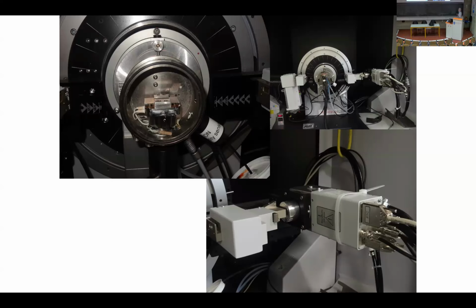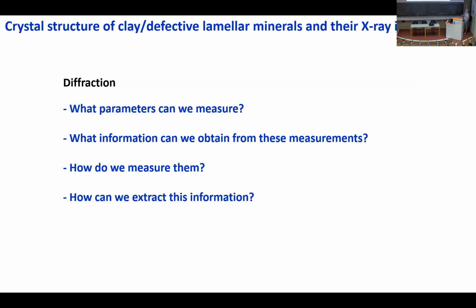Okay, which means that in doing X-ray diffraction, what we are choosing to do is to be interested, at first, in the periodicities that are present in the crystals. And then we will see that there is a way to get information not only on the periodicity, but on what atoms are present where in the structure, and which kind of atom are present where in the structure.